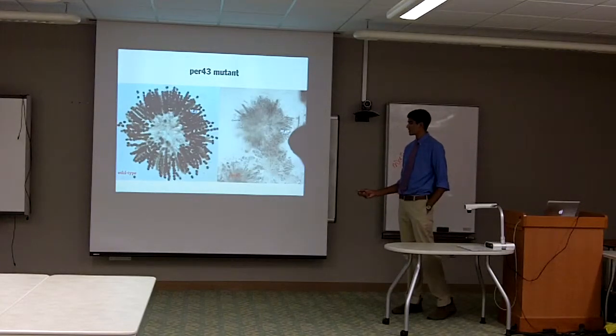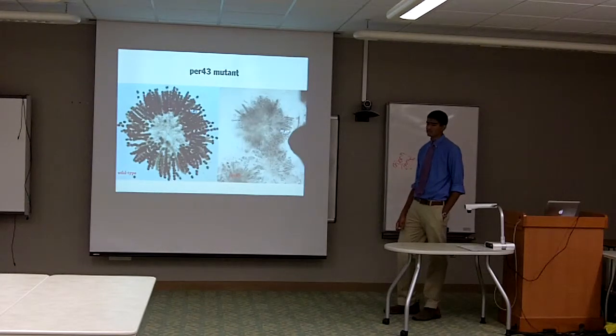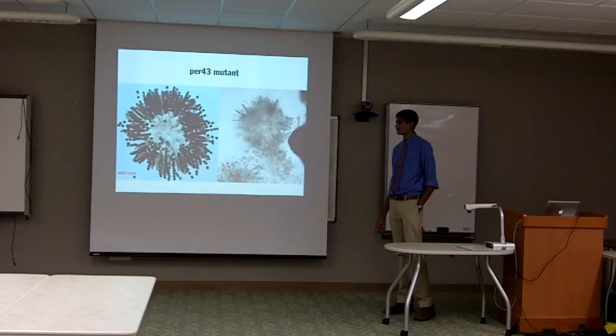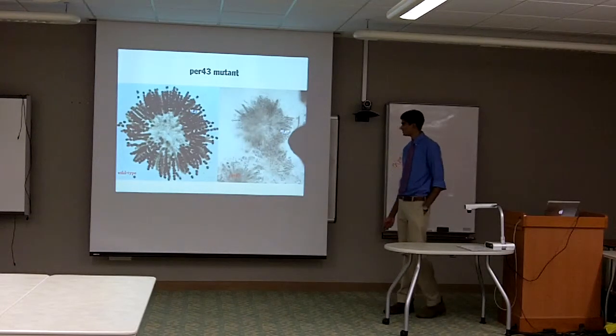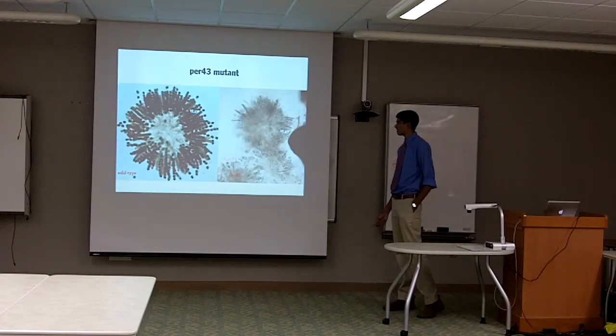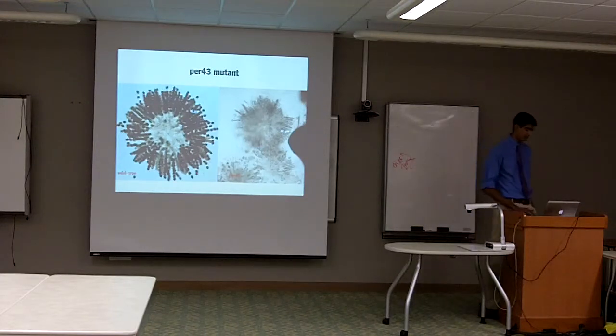So the wild type's over here. You're looking at just a bunch of asci in a circle. Note how each ascus has eight spores, and they're all very uniformly shaped, they're all black and circular, and there are always eight spores per ascus. This is the same exact thing for the mutant. Notice how the spores are very, very irregularly shaped. Some are very long, others are much shorter, and there are almost never eight spores per ascus. So basically there's a whole lot of inconsistencies. And basically, this mutant is just having a lot of trouble actually producing spores the way the wild type can.